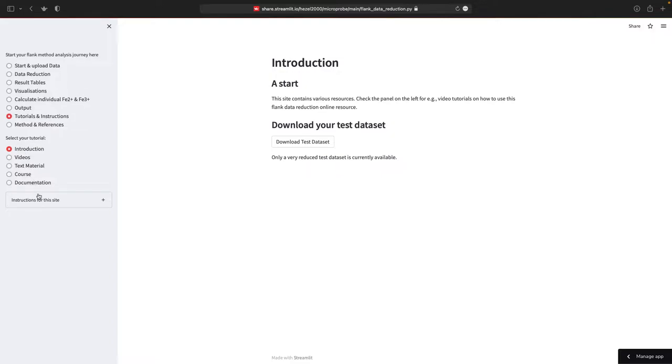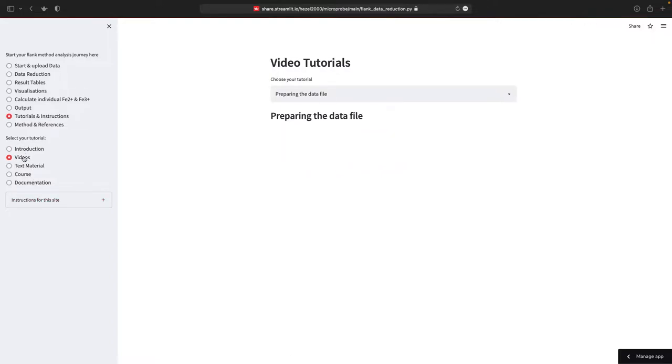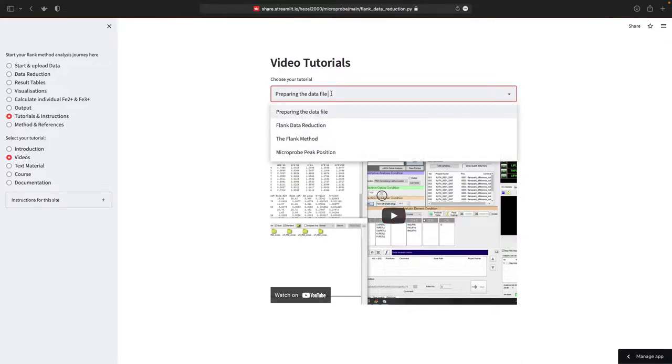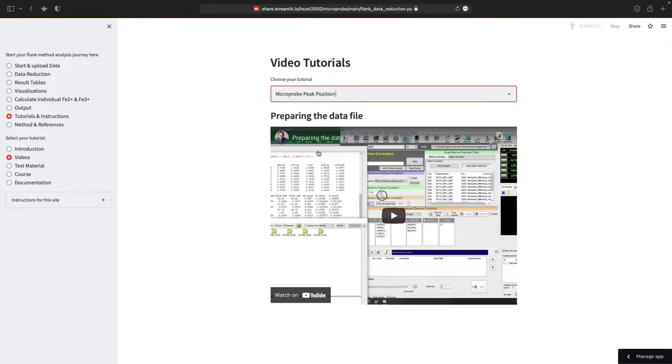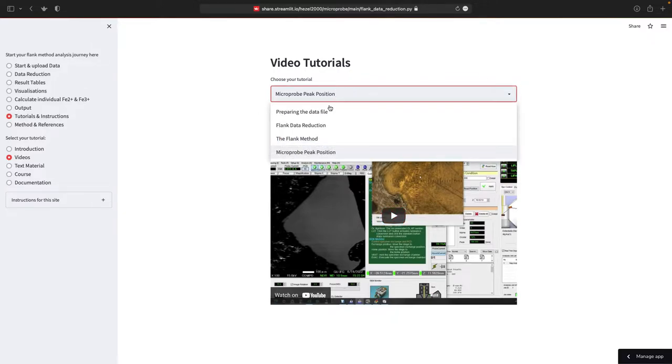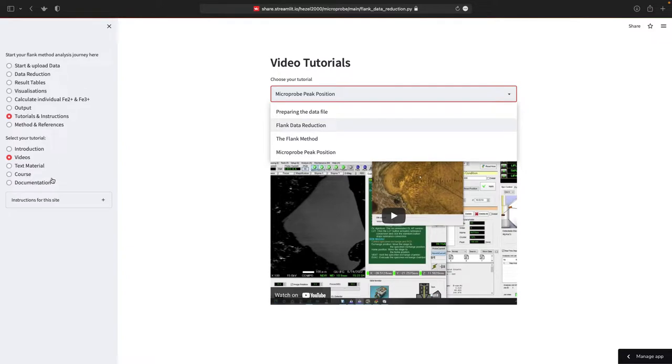There are some sub-menus, for example there's videos. You can go to the videos and it shows you how to prepare your data file, how to find the peak position and the micro probe file and so on. And once you're happy with the text material and others, this will be filled over time.